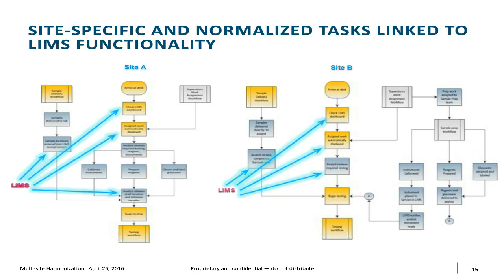So in going through this process, when we got to that future state, through very carefully facilitated actions, we developed the future state model, such as the one we're looking at, that while we are cognizant of the nuances of geographical differences between sites, we also have argued and finally agreed upon, negotiated, whatever you want to call it, things that we can do the same across multiple sites. So those are the normalized functions. The fact that we've identified differences between the sites still allows us to develop a harmonized model. With the advent of LIMS, it's brought all of these productivity increases to the operation.